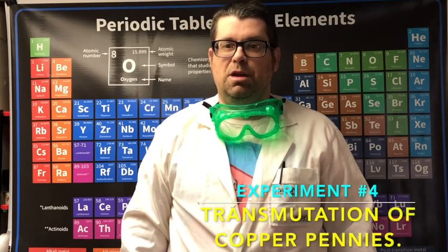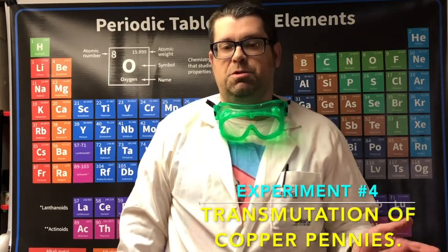Okay, in today's lab, we're going to be learning about a special kind of solution called an alloy. Now, solutions are a homogeneous mixture where you have two types of particles mixed together evenly to the point where everything looks the same throughout. So the mixture is spread out evenly. Think of it like Kool-Aid, where you have a solid dissolved in a liquid.